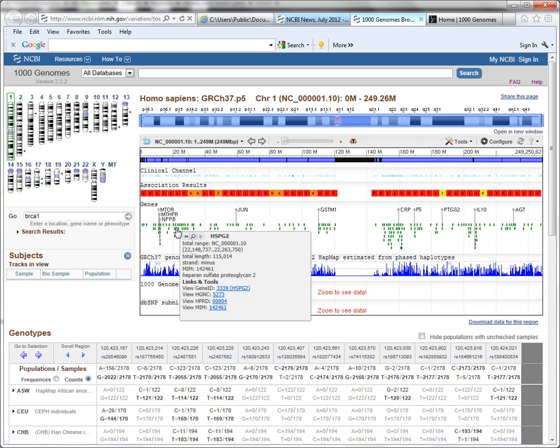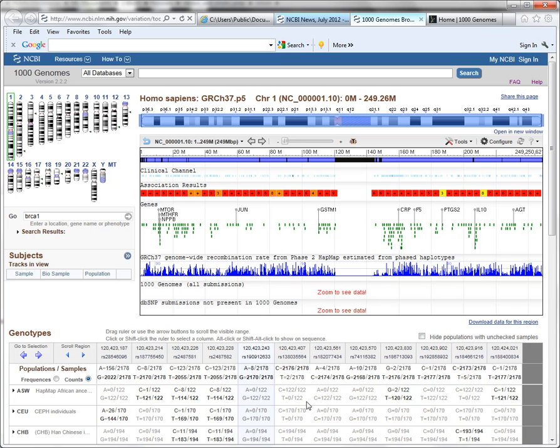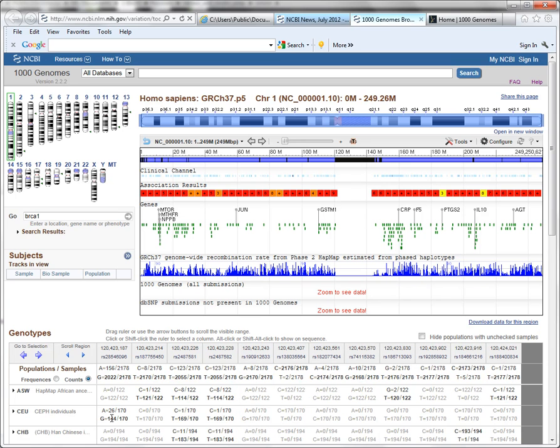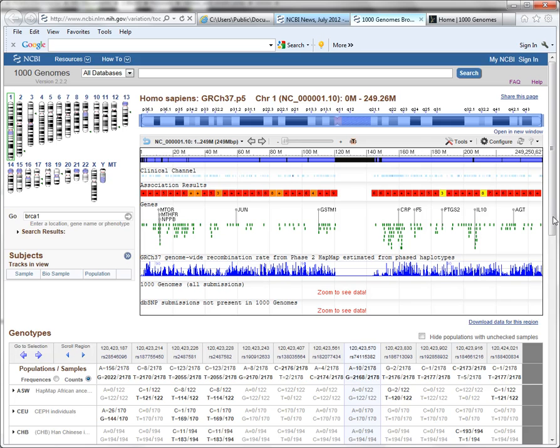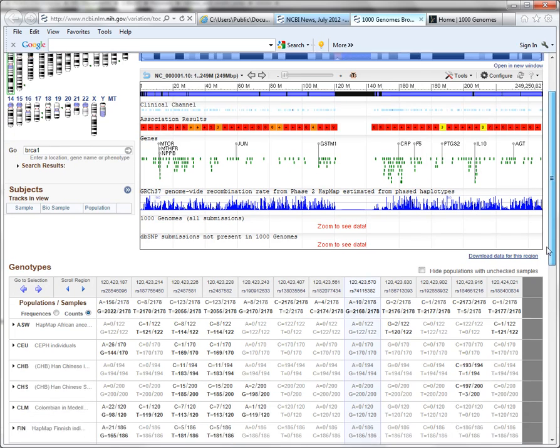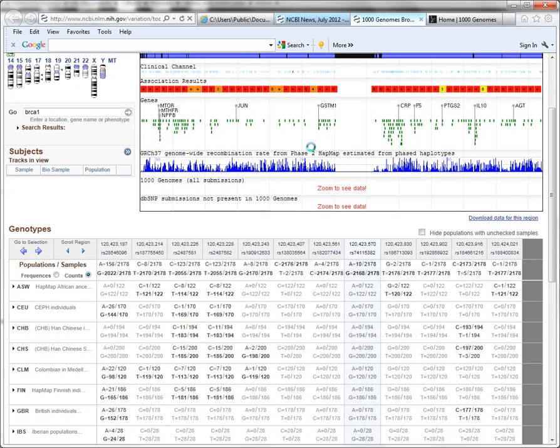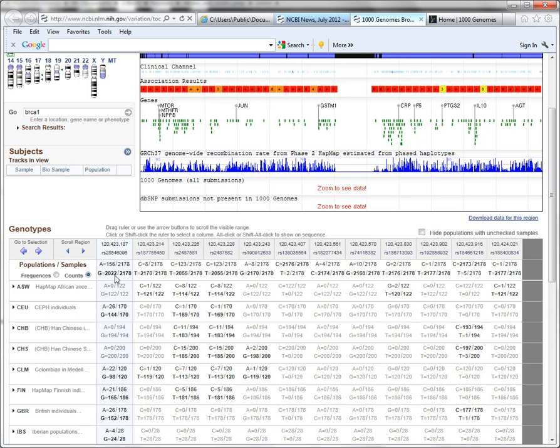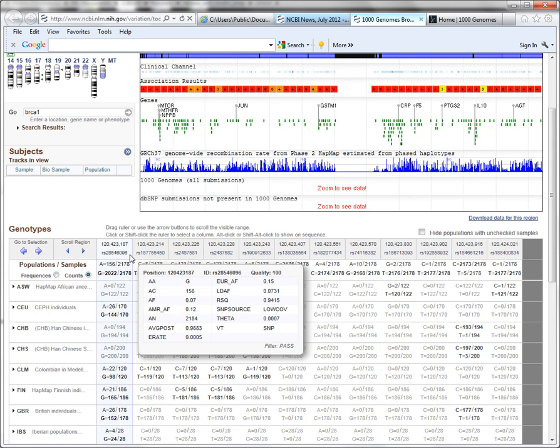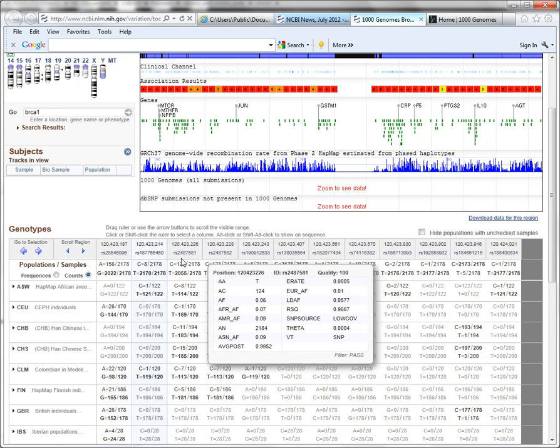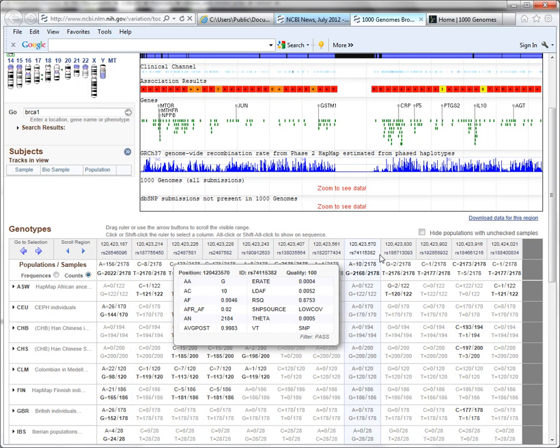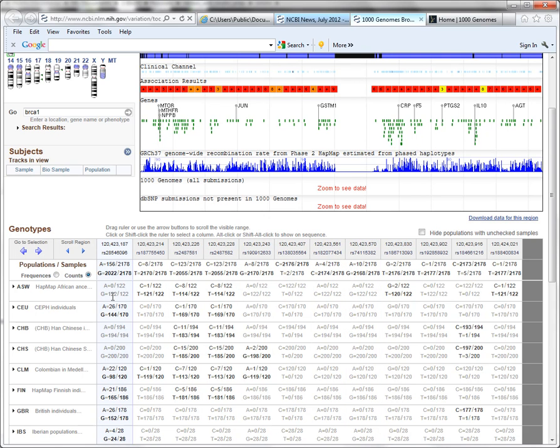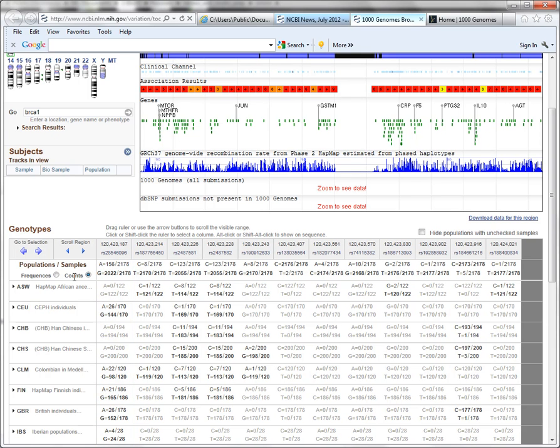The last main widget that is on this browser page is the genotypes widget, and what you see in this widget is a list of various populations, and then along this area of the chromosome, you see the different variations, and in each population, you see the frequencies. You can actually toggle between counts or frequencies. Right now I'm displaying counts.